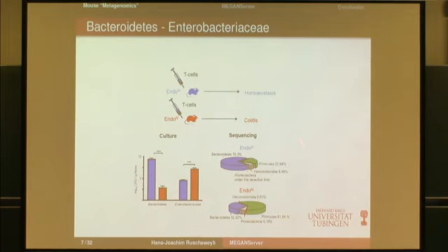And if you do sequencing, it was 454 sequencing, you can see that there is definitely a big difference between these two, especially in Bacteroidetes, but also in Firmicutes, which apparently fill up what Bacteroidetes is missing. Also there is this little bit which is the Escherichia, Enterobacteriaceae, Proteobacteria is just a level higher, and here it was far under the detection level. I merged a couple of samples together and it was still not findable.